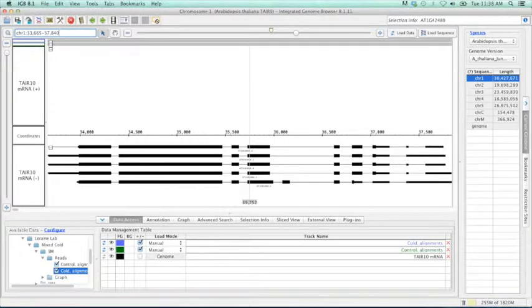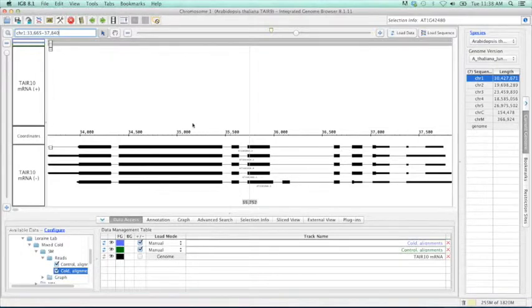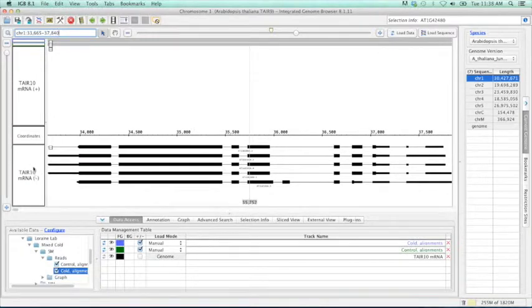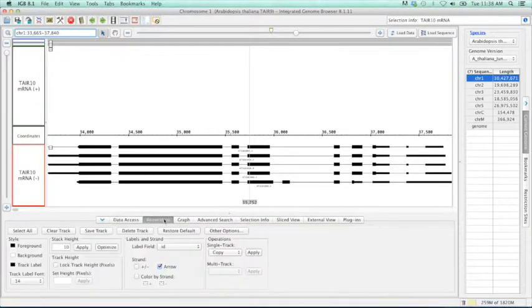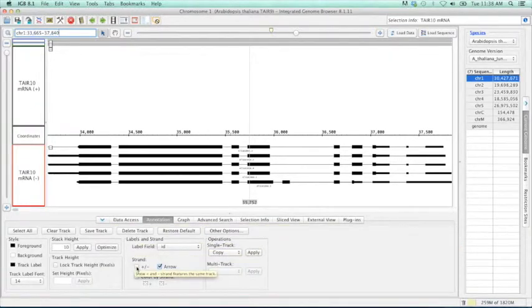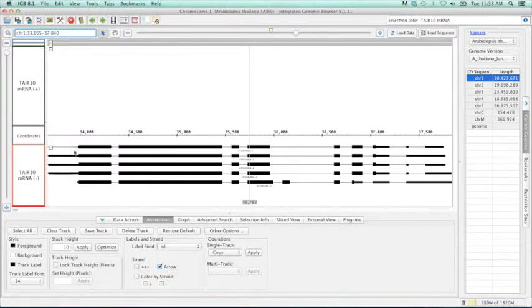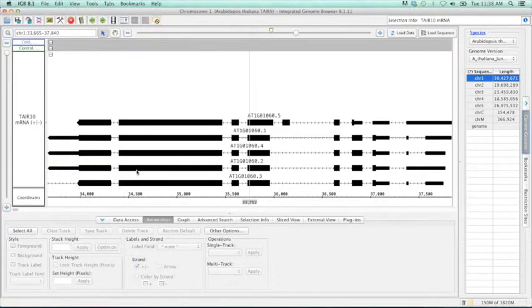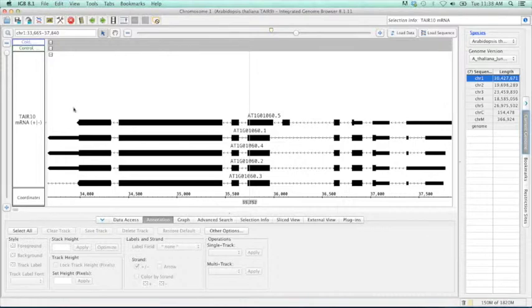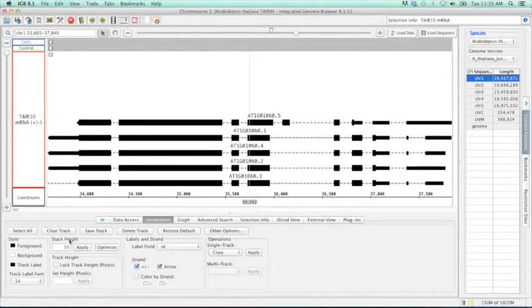Before we look at our alternative splicing data, let's simplify this view a little bit to give us some more space to work with. If we click on either the minus or positive strand, go down to the bottom, and click on annotation, we can then combine these two tracks into one using this strand, plus minus. Now, we can see that all five of these gene models on the negative strand are now combined with the plus and minus strand.